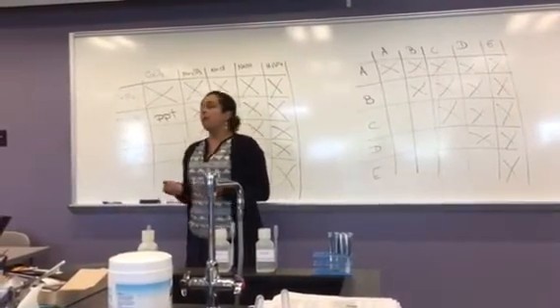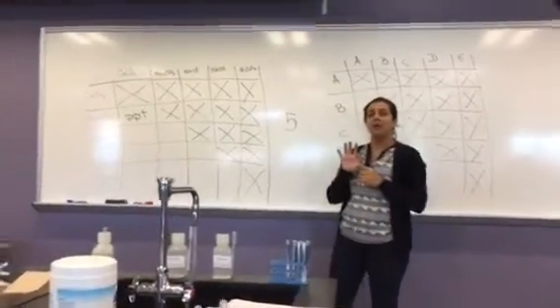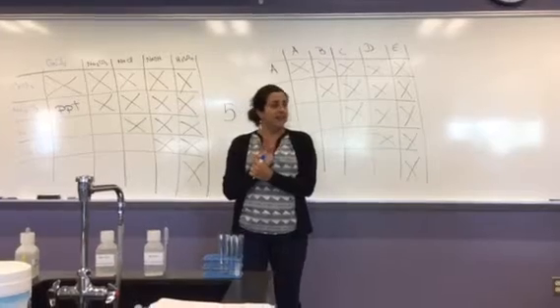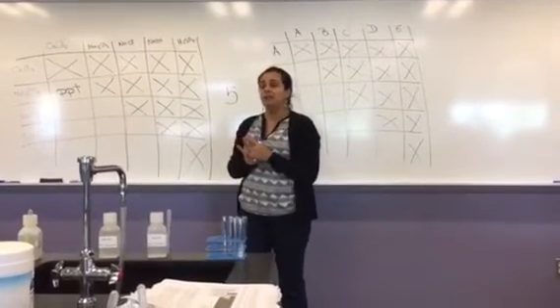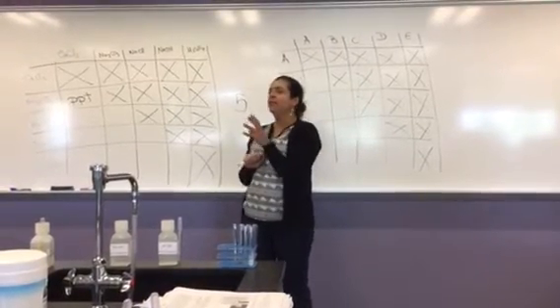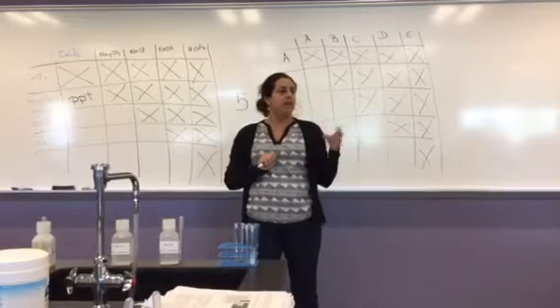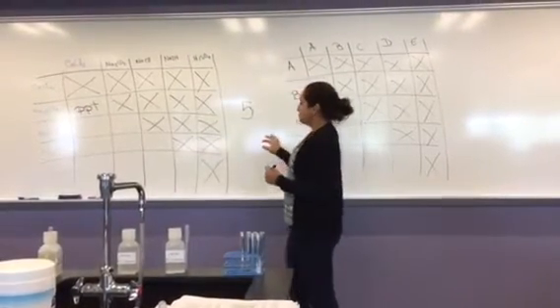So I'm telling you right away, we're gonna see 5 reactions, only 5. In one of those, we're gonna see a gas forming, and in another one, it's gonna get hot. You might feel it, you might not. If your hands are warm all the time, you might not feel the difference. If your hands are cold all the time, you might feel the difference, okay?